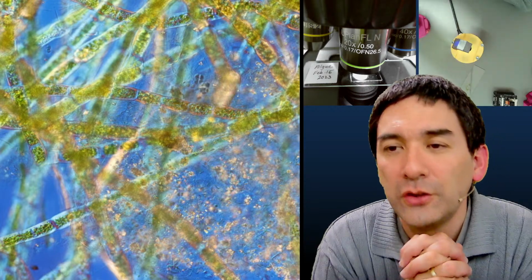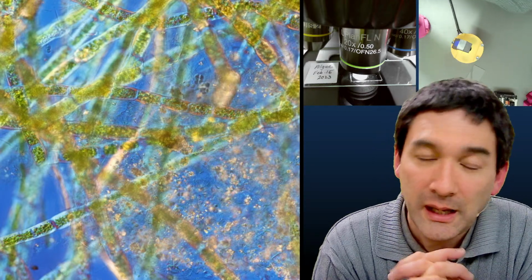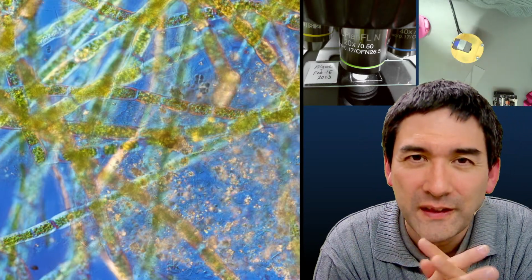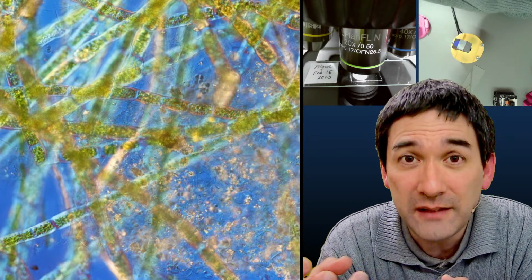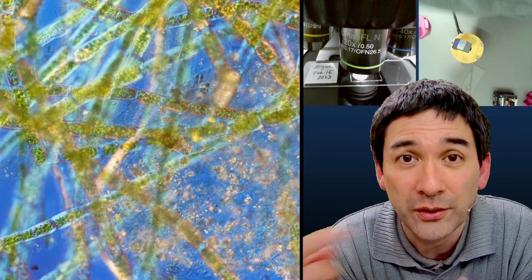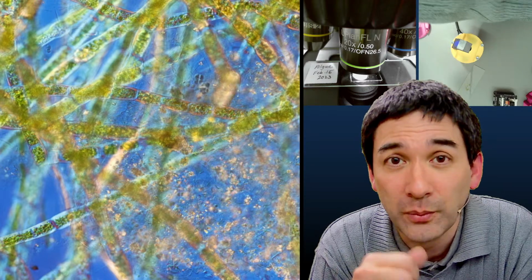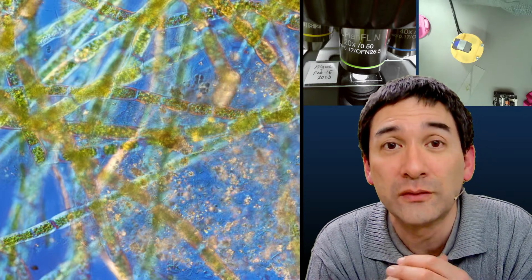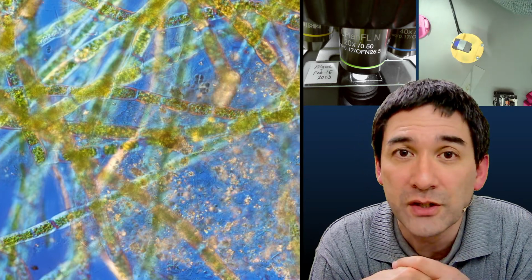Well, it depends a lot on your interests. Even in winter it is possible. I also made some videos on this because it depends a little bit how frozen everything is. But what you can do is you can get yourself some decomposing leaves. You take them home, you leave them in a moist area for a couple of days. You allow the microorganisms to regenerate, and then you carefully scratch off the surface biofilm with an object and put that under the microscope. So there are plenty of microorganisms obviously still around during winter, but they need some time to regenerate a little bit, especially when everything is frozen.